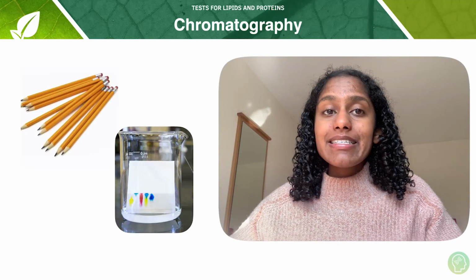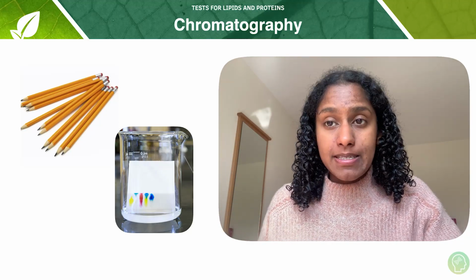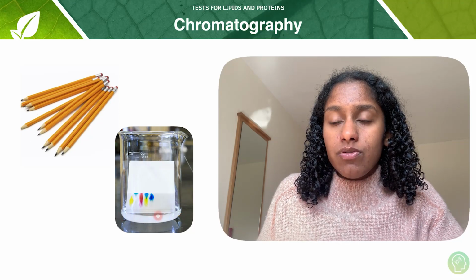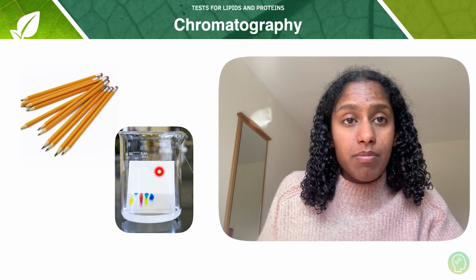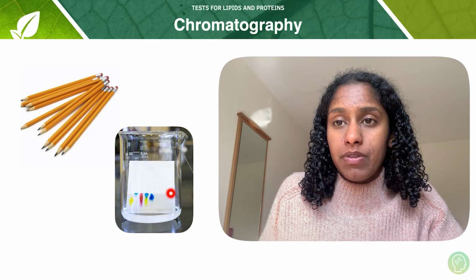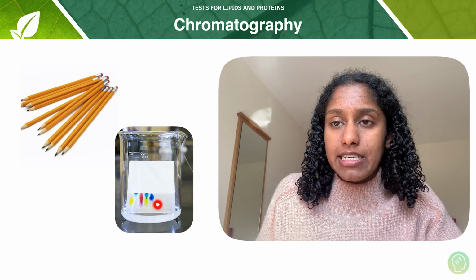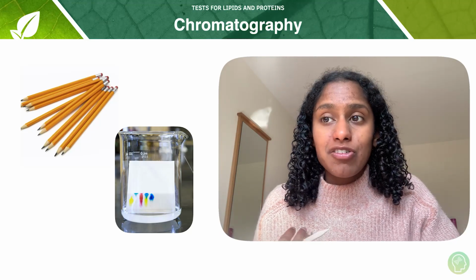Okay, so as the mobile phase moves through the stationary phase, the different molecules become separated at different points. So on this diagram, our stationary phase is our piece of paper, our mobile phase is this solvent in our beaker. Our solvent, or our mobile phase, is moving up our stationary phase. The solvent is moving up our paper. So you can see that this is the front of the solvent line on this piece of paper. You can see it's not quite reached up here yet, but it will with time. And you can see here that these molecules are becoming separated at different points. Now, this is because different molecules dissolve in the mobile phase to varying degrees.